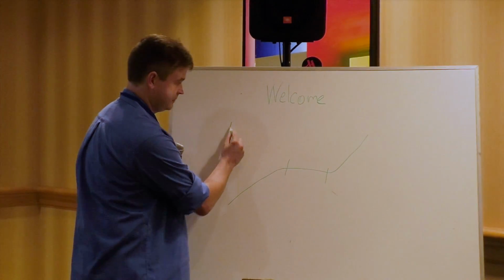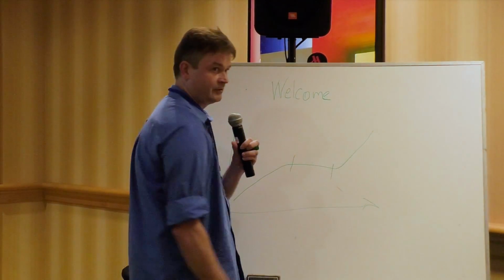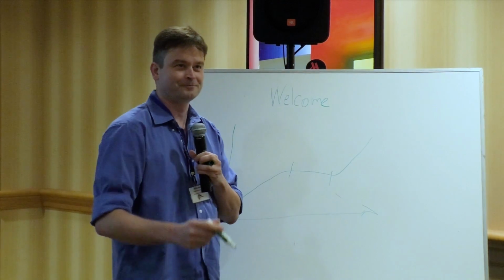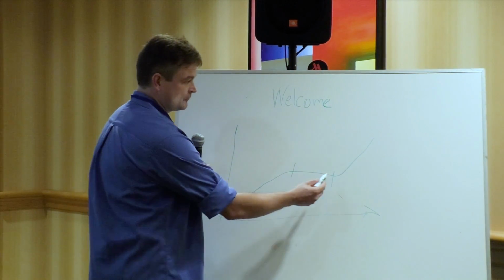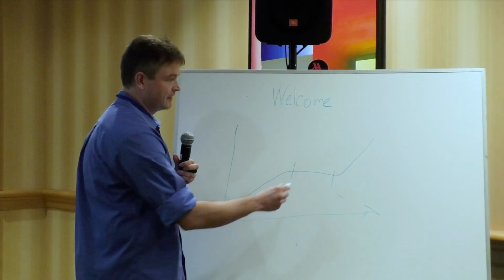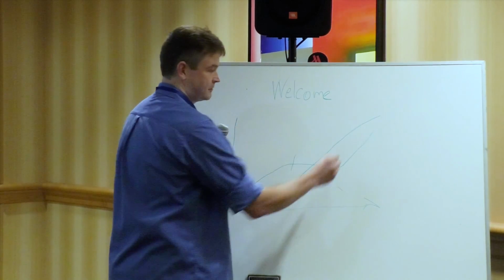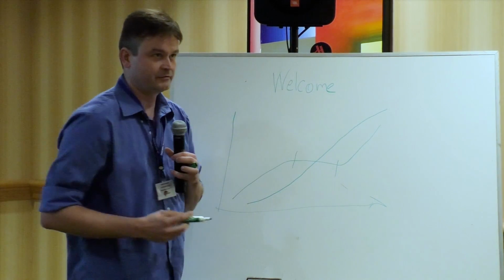If you have something like, so, well, it's meant to have everybody up front here, so I only talk to it for the camera. Okay, so if you look at thresholds like these, in single molecule FISH, we often look at intensity distributions that look like this. Yeah, and you make a best guess.